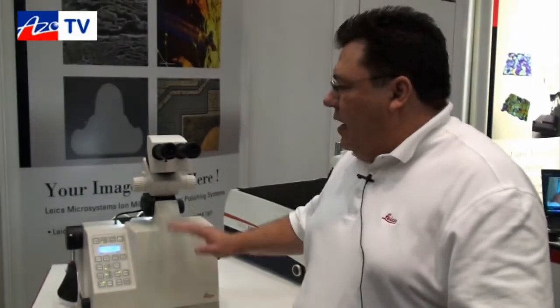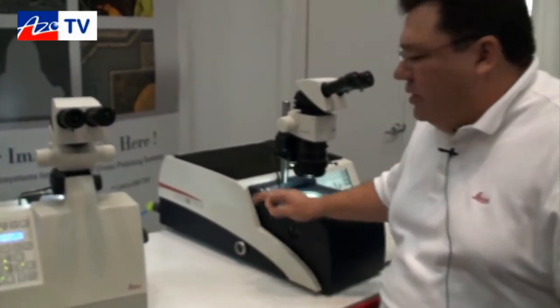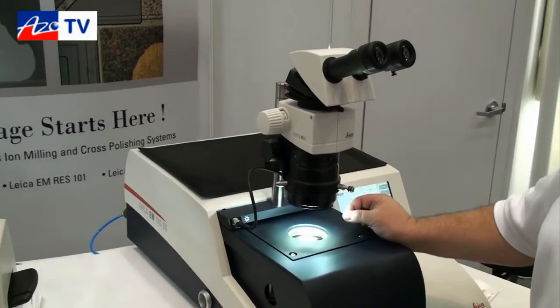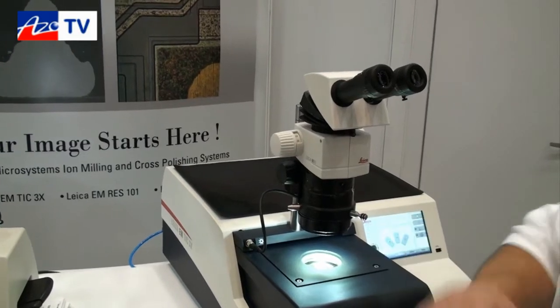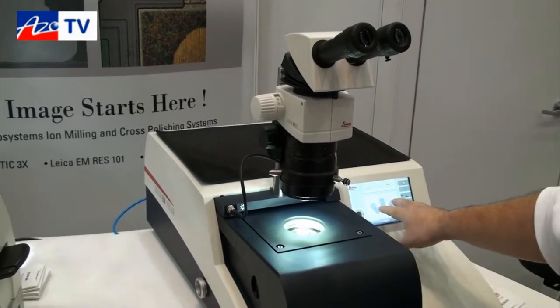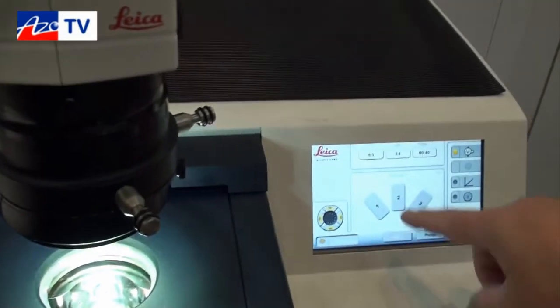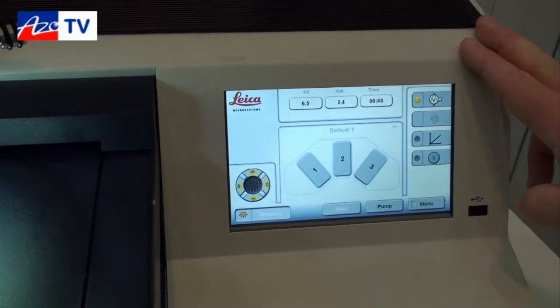Then what we would do is take the sample from the TXP over to our next instrument — this is our TIC 3X cross-sectional system. By putting the sample into here, it utilizes three ion beams to give you a nice polished surface: a very wide polish surface of four millimeters wide by one millimeter deep. It's fully touchscreen controlled, and all three guns are capable of having different parameters and being turned on and off.